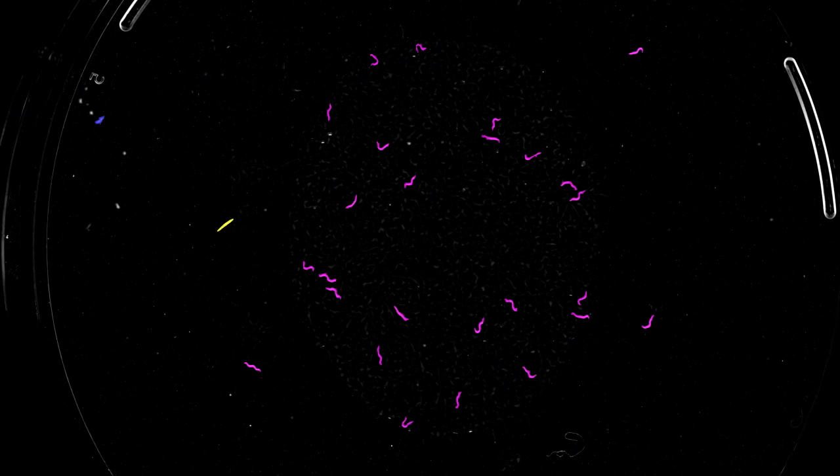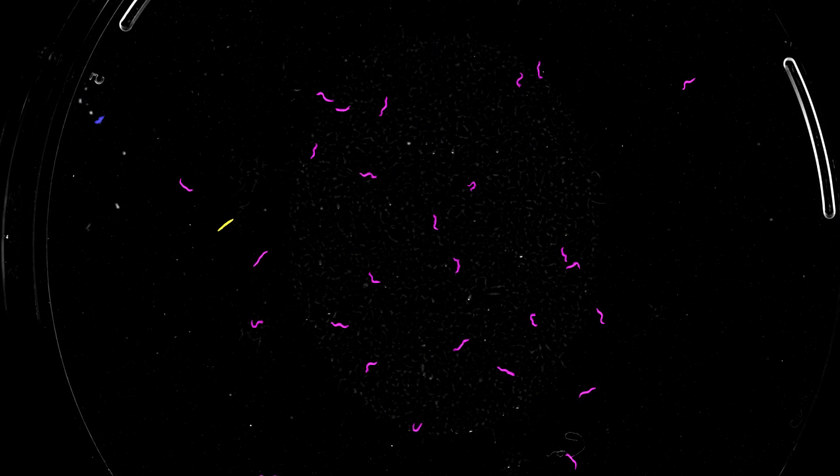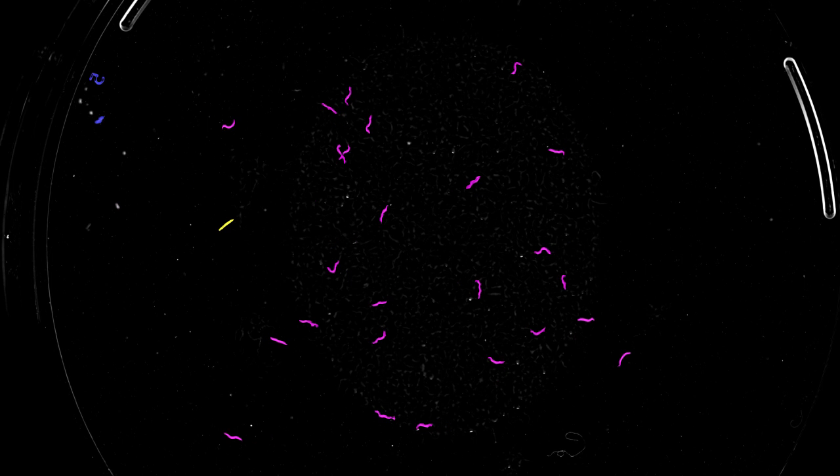The Lifespan Machine is essentially a large distributed microscope that allows us to observe large populations of C. elegans simultaneously. It's a high-definition time-lapse microscopy device, and basically what that means is it takes images of agar plates with worms on them every hour for the entire duration of their lifespan.